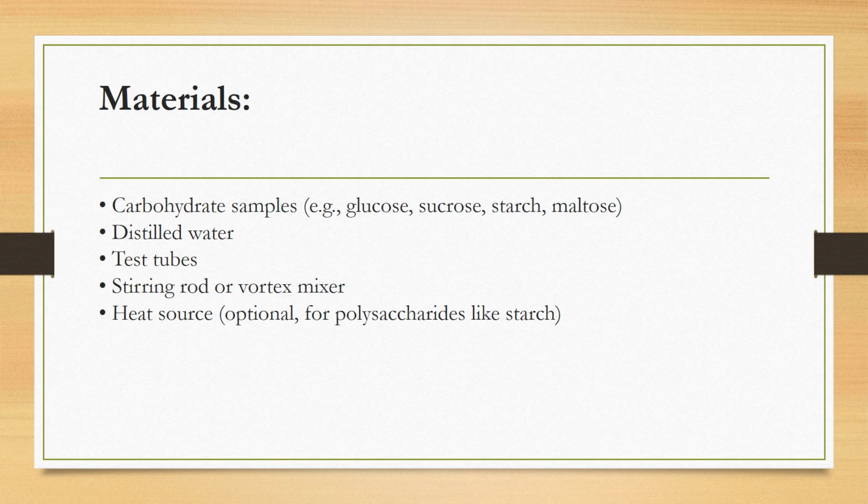The materials: carbohydrate samples. The samples we will use are glucose, sucrose, starch and maltose.